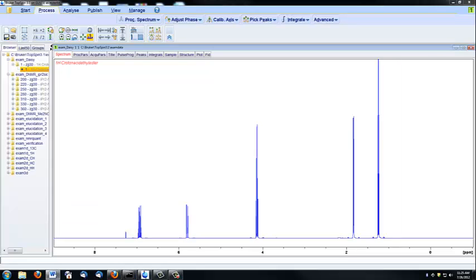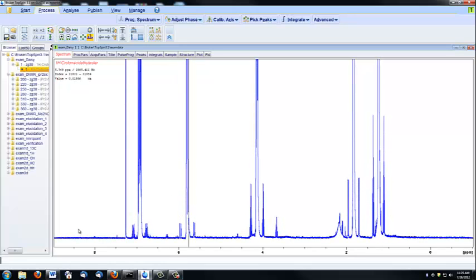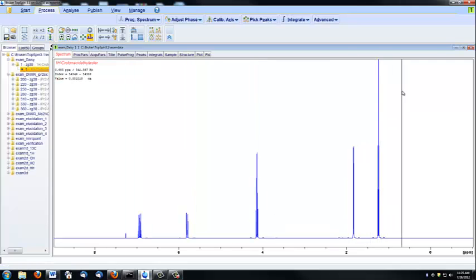If you feel like you've gone too far and you simply want to start over, you can click this button here, and it will reset the intensity, making your most intense peak sort of the upper limit of the spectrum.